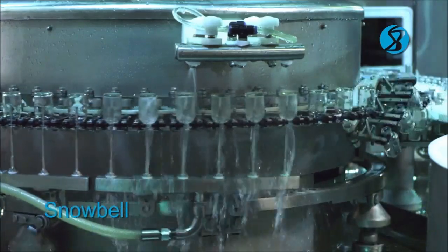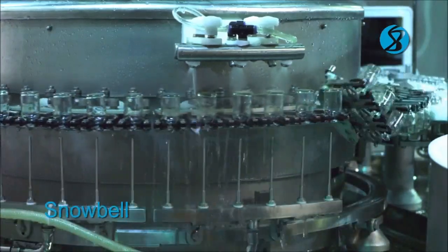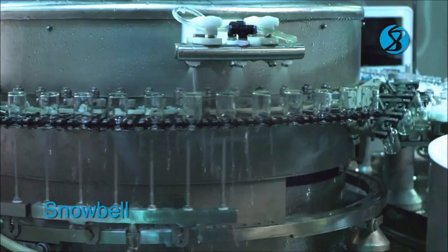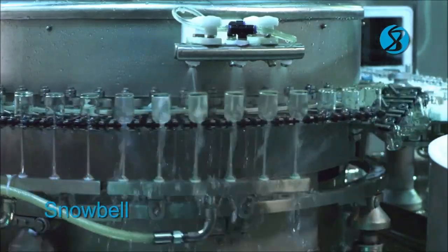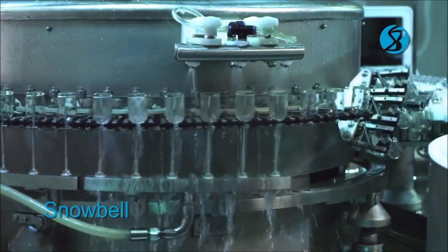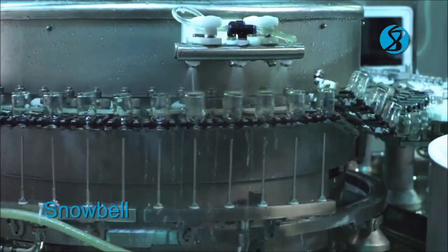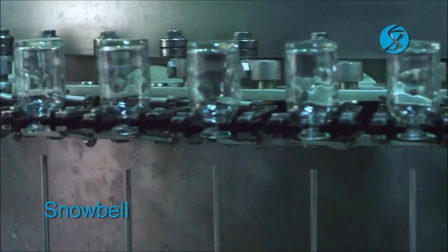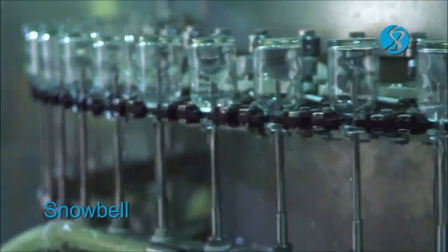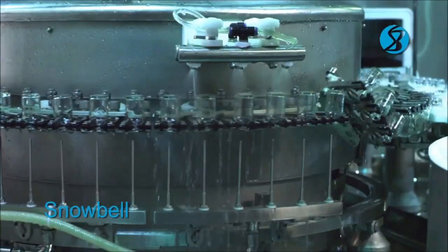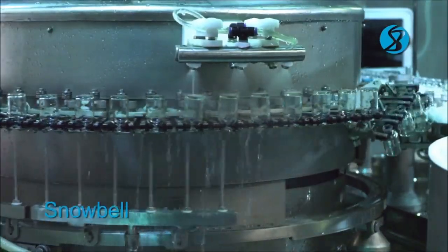At the individual stations, spray needles travel in synchronism with the vials, with orifices exactly centered. The spray needles follow the continuously moving grippers from start to the finish of a working station and retract. As long as spray needles are inside the vials, spraying with cleaning media takes place.